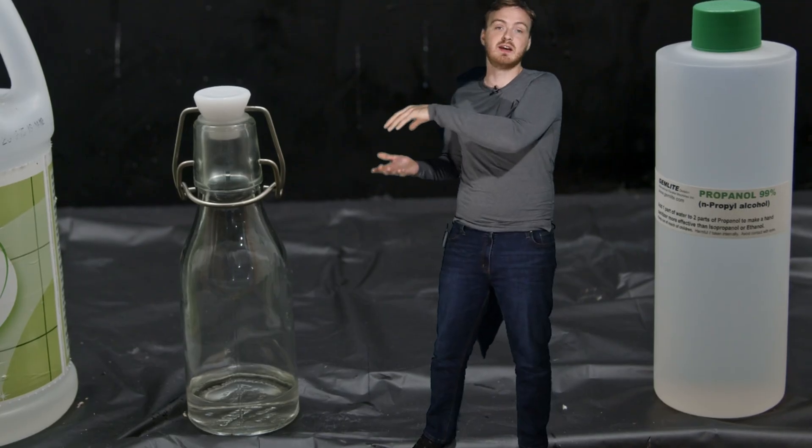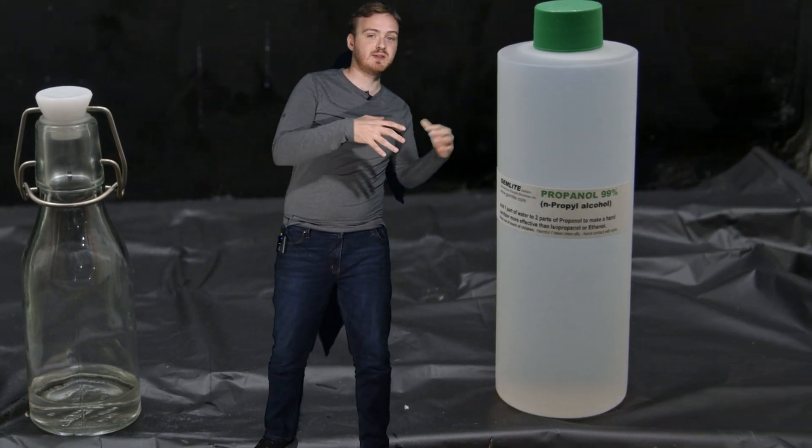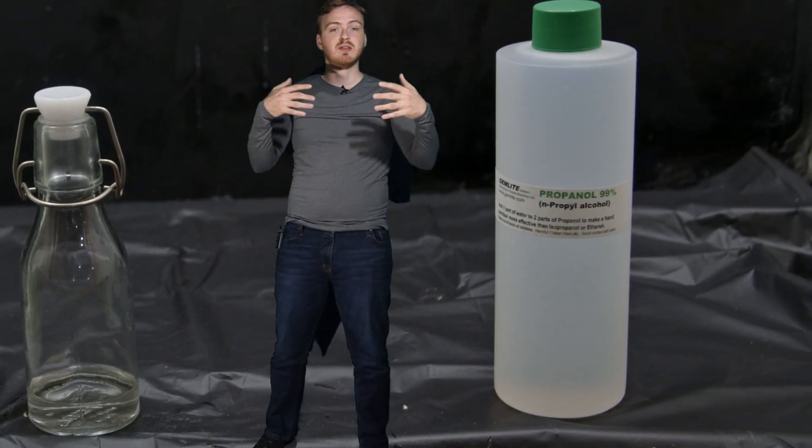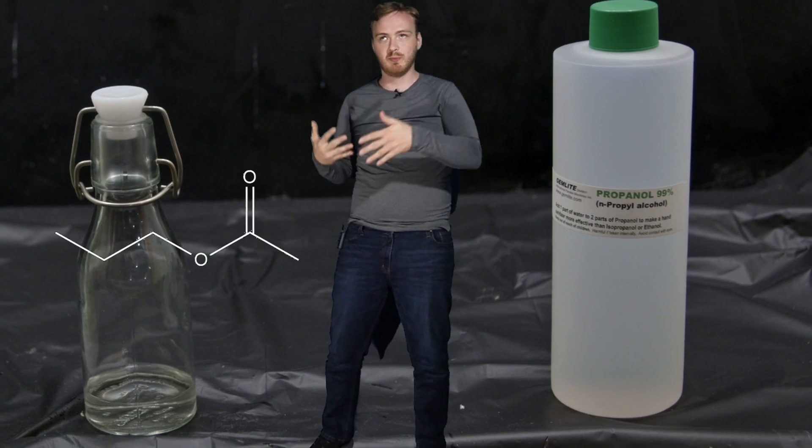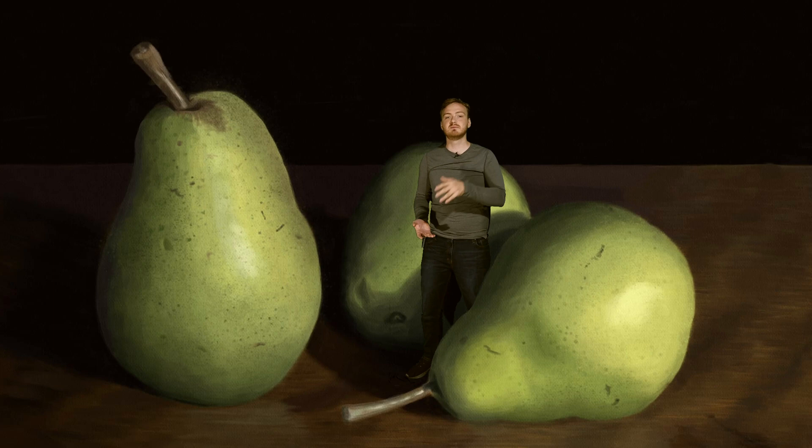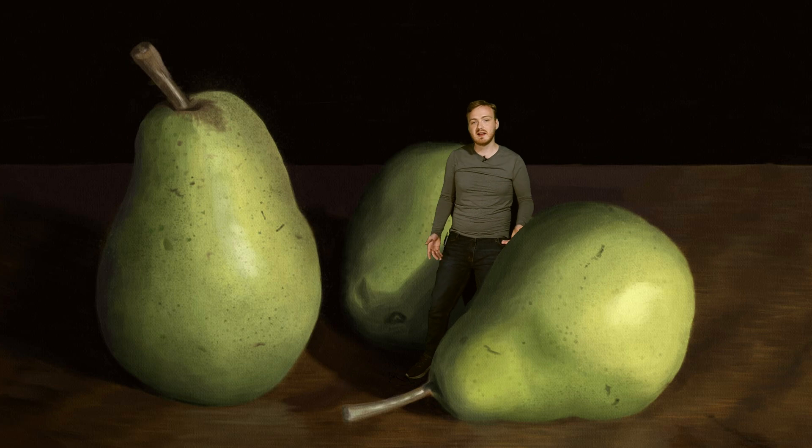Today we're going to be taking that acid, combining it with this alcohol over here, and they're going to sort of weld together to make this new chemical called propyl ethanoate. Now this stuff is supposed to smell like pears. It's used as a food additive, so I've probably had it before, but I've never had it in its pure form, so we're going to see what that looks like today.